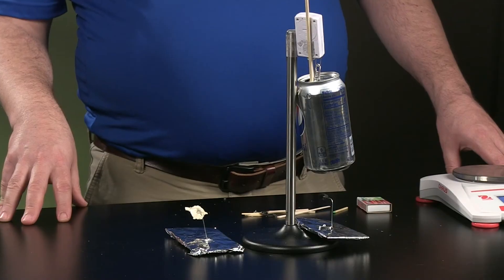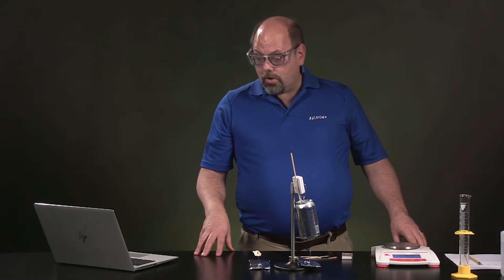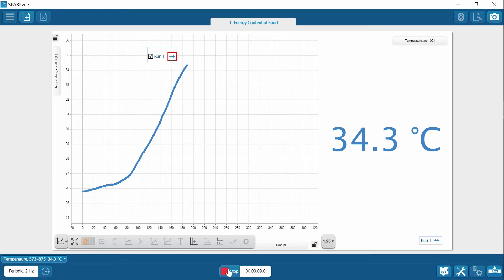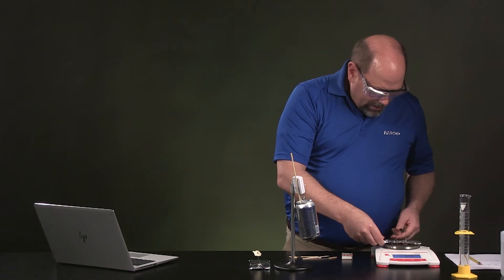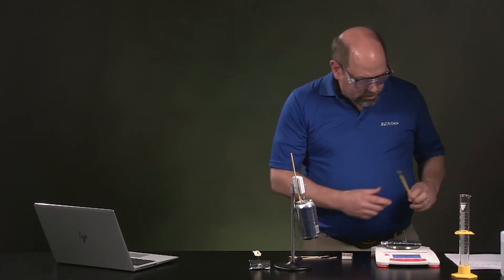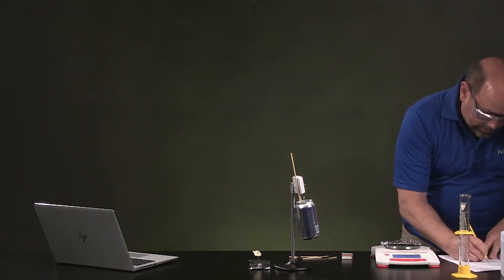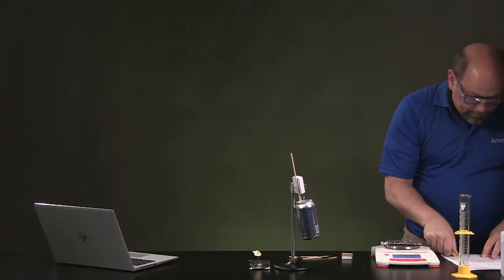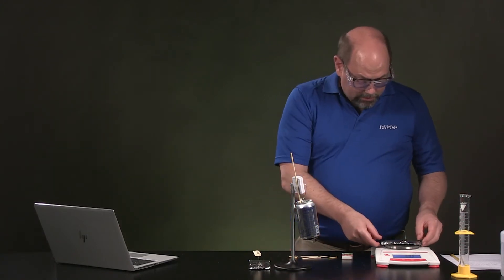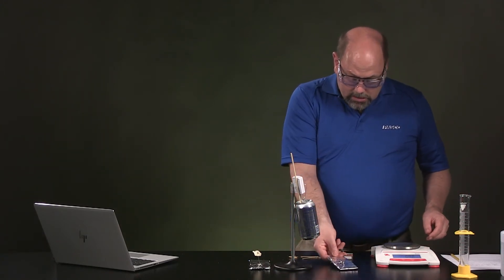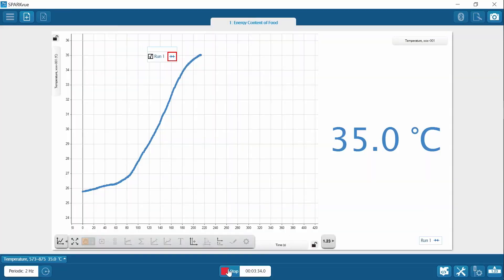The flame has gone out on the peanut. It's burned as much as it can. You don't need to burn it all. You just need to know how much it was you burned. I can see that the temperature is still going up a little bit. So, while we're waiting for that to keep, you know, stop going up, I'm going to go ahead and move this and weigh it. We'll find out how much burned. Now, that's 6.32 grams. So, that's 0.42 grams of peanut that had burned. The temperature still is going up a little bit more. I'm going to let it finish warming up.